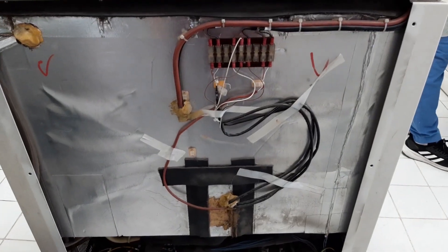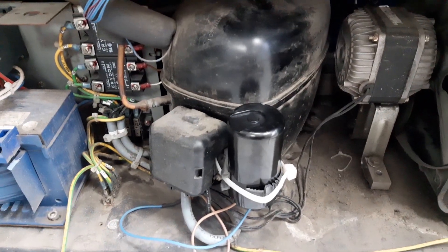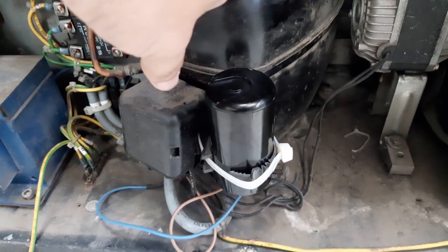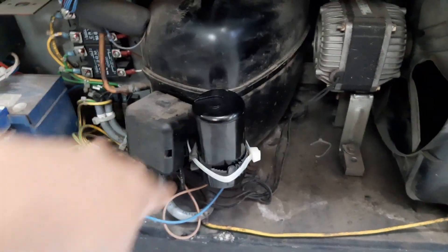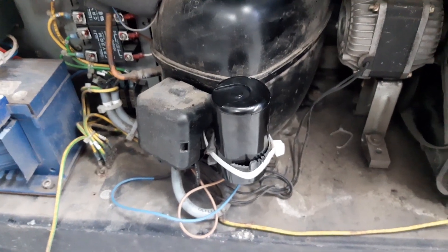Here at the back side is the compressor and as you can see there is a starter capacitor. The compressor is still hot and most of the time the problem with this one comes from this starter capacitor.